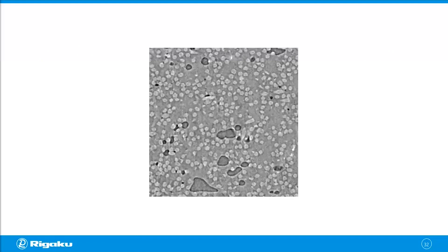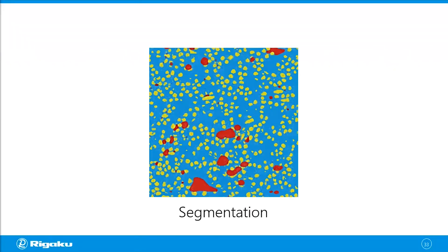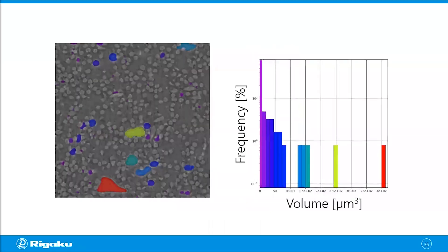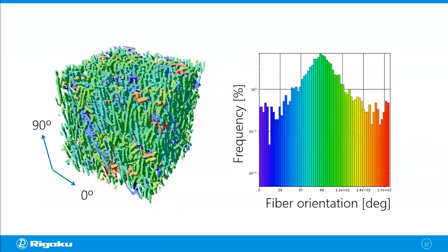Here's another example: a computed tomography cross-section of a carbon fiber reinforced polymer. The mid-level gray is from the polymer, the light gray from the fibers, and the dark gray is air — those are voids. You can segment this image into three different phases, then focus on one phase at a time. Looking at the voids — shown as red pixels — you can see different groups or clusters. You can label them as separate objects and check properties like volume, surface area, or location, and analyze them individually.